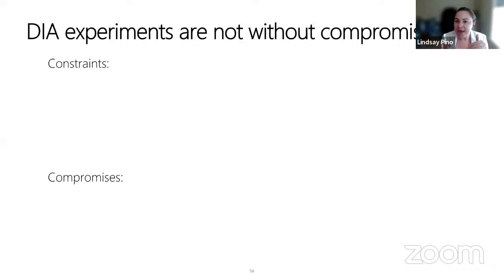So that was two ways for us to think about DIA. You could think about it at a high level as just a way to balance number of samples, number of proteins you measure and how sensitive they are. Or if you're more of a mass spectrometrist, you can think about it as that ion map. Kind of depends which way you're approaching mass spec proteomics, more from a biological question side or from more of an analytical chemistry side.